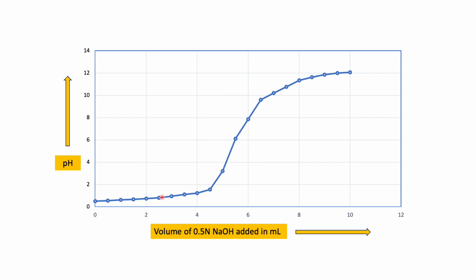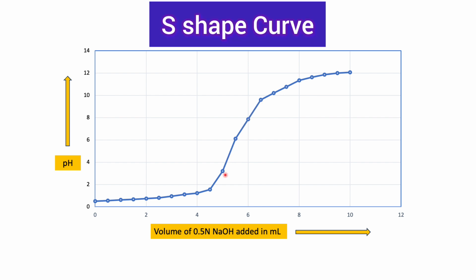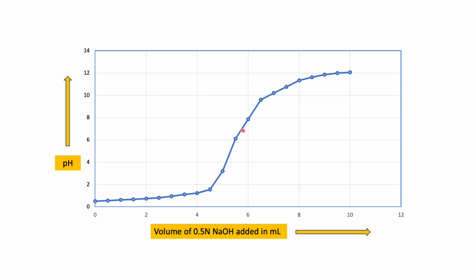So the salt that is formed is neutral, and the pH increases till the complete neutralization point. So the middle point of this shows the increase, this shows the jump. We have added 0.5 ml of the NaOH at a time, and on plotting the graph of delta pH upon delta V versus the volume of NaOH added, we can get the exact end point. So here, if we take the volume in between, we can say at this point a sudden jump is observed, so it is around 7 pH.